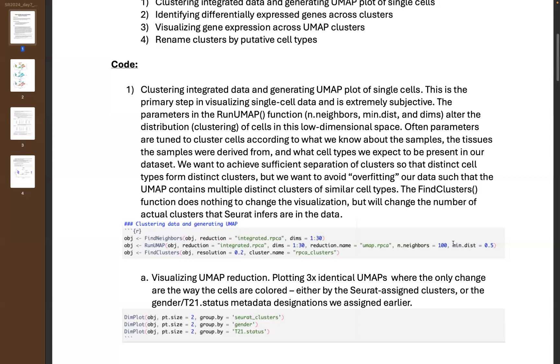The n_neighbors and minimum distance parameters are really useful — by changing these values, they have profound effects on the way the clustering actually looks. For your experiments or data analysis purposes, you might play around with these values quite a bit, lowering and increasing them in a combinatorial fashion. You'll be able to see that changing these values really has a profound impact on the way the clusters form.